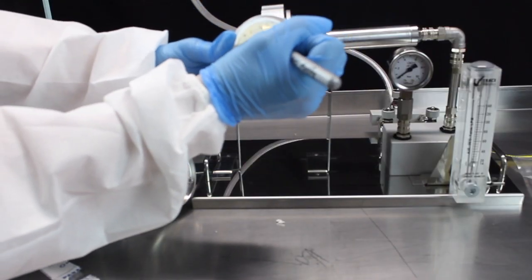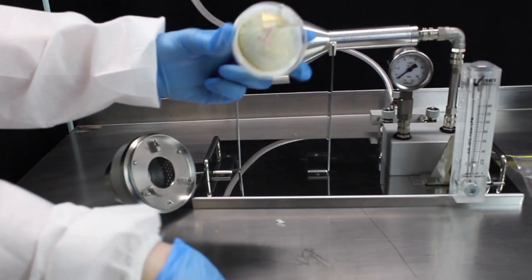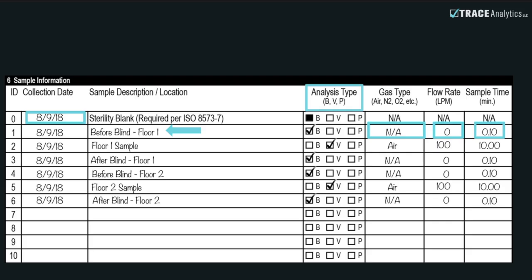You've marked each plate with a corresponding number. Fill out the collection date and the location sampled for your reference. When you reach the column titled Analysis Type, mark the appropriate analysis test that is on your purchase order. All ISO 8573-7 blinds should be labeled Basic.